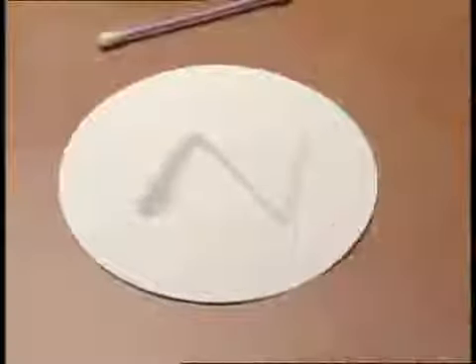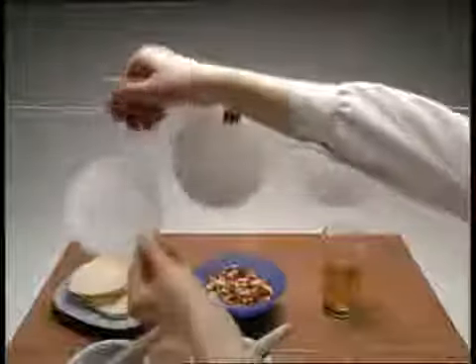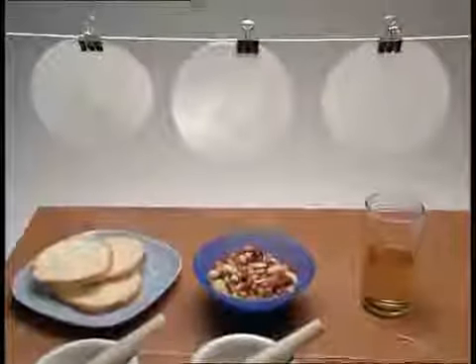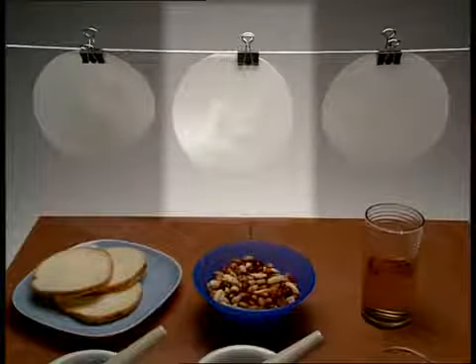They all look translucent to start with because they're wet, so it's important to leave them to dry for a few minutes. Here are the results. Only the nuts contain fat.